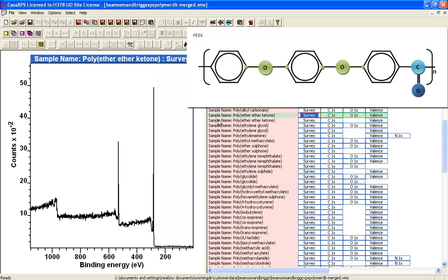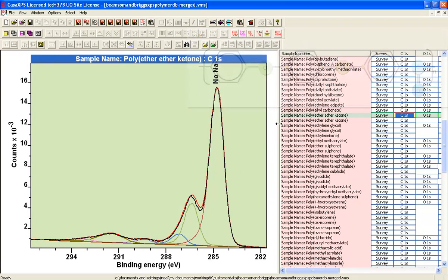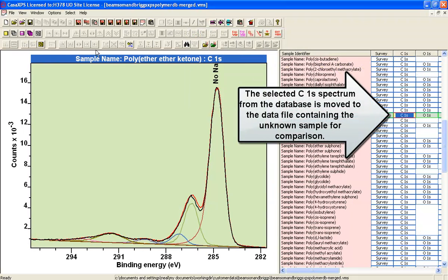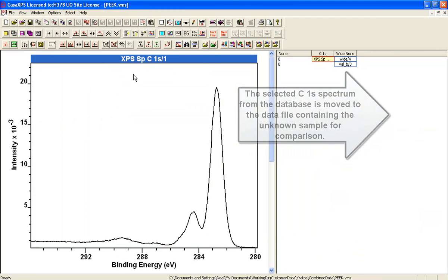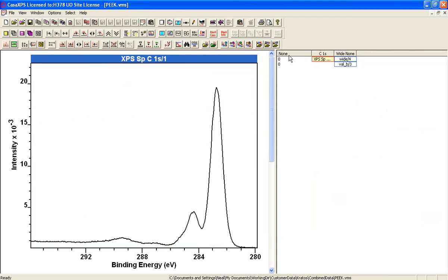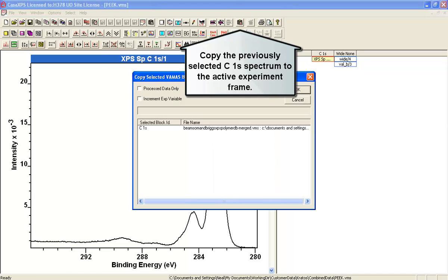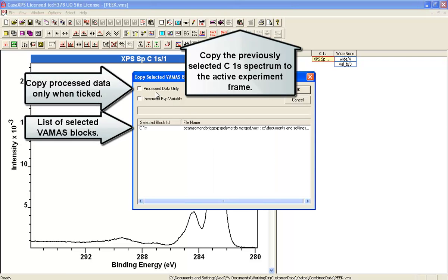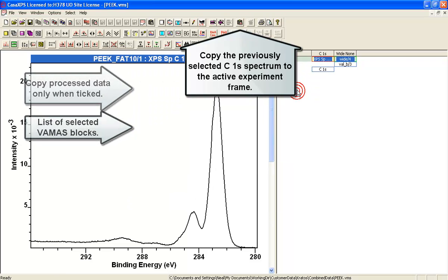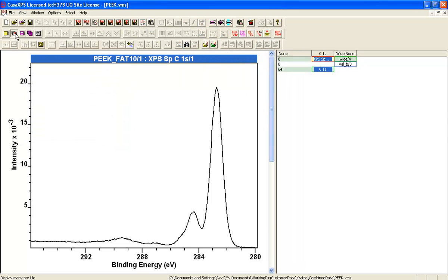So when I display this I can now see I've got PEEK and that is the peak fit from the Beamson and Briggs Polymer database. And I can now move that if I wish to the file and I think I'll just take through the data only and forget the peak fit. So I can just compare spectra.